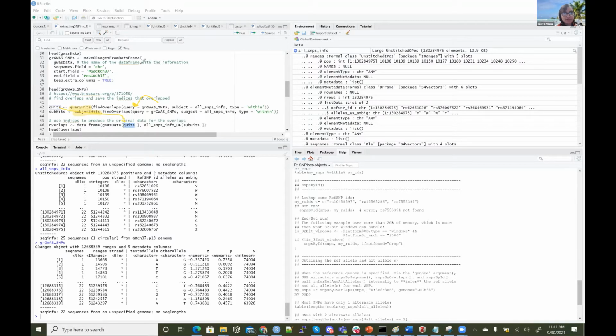In other terms, so you can understand that, I want to explain it. You have the Q hits here, and this Q hits comes from this GR SNPs. And this GR of our SNPs here has this GWAS data here. And then this GWAS data will come here.